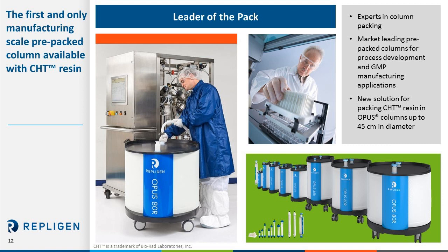Yeah, it's a good question. I think the main hurdle was simply making sure that the column packing results were consistent pre and post shipping, and to go along with that, that the packing method itself is reproducible.